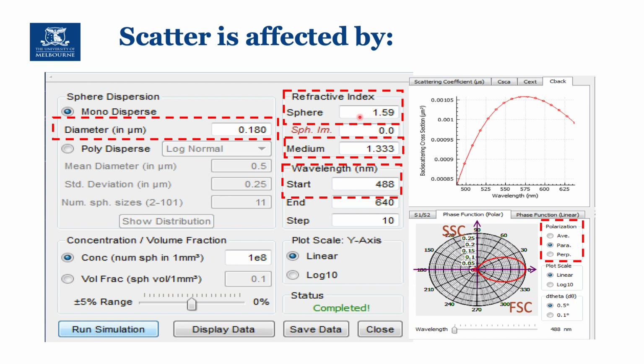This particle, I think, is polystyrene. You can see that the scatter tends to be mostly in the forward direction, very little in the side scatter direction, and that's why most instruments use a highly efficient photon detector for the side scatter measurements, and forward scatter can be measured with things like photodiodes, which are less efficient. But it's a complex function, that's what I mean.